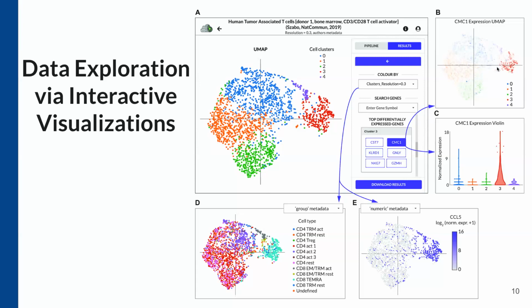We can also have all kinds of different labels like BCR receptor, TCR receptor, all these different mappings that have been done experimentally can be brought in as text files, uploaded, and mapped to this existing visualization.